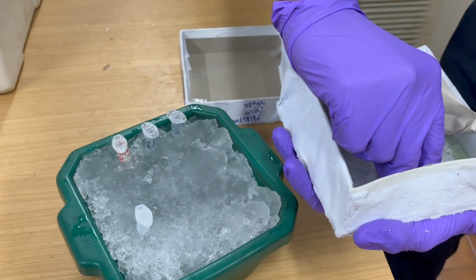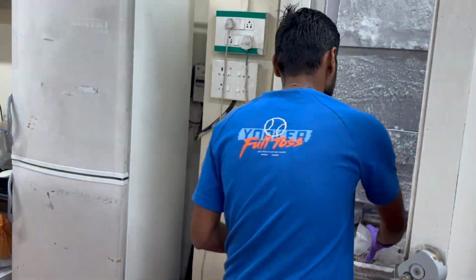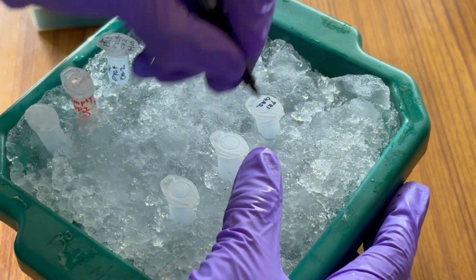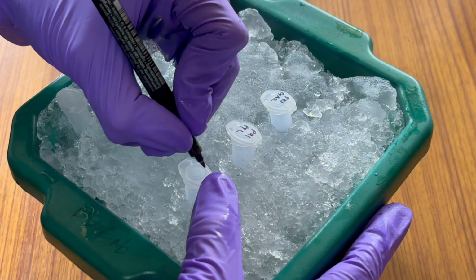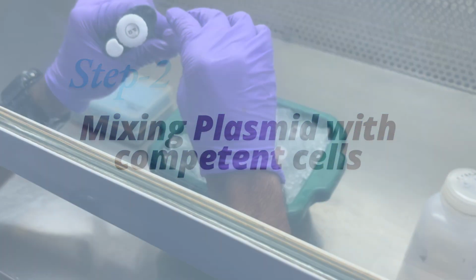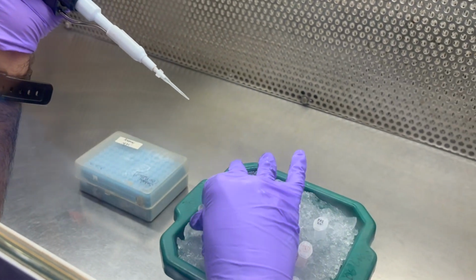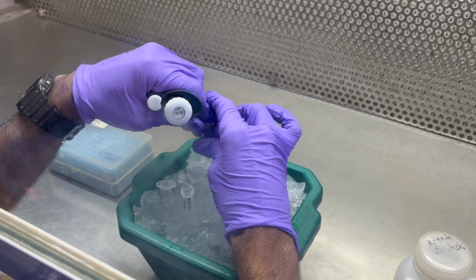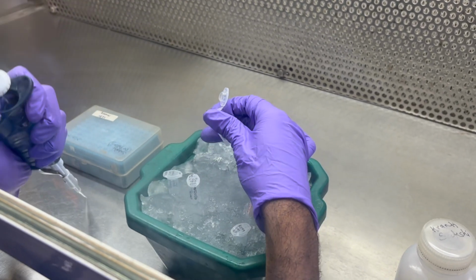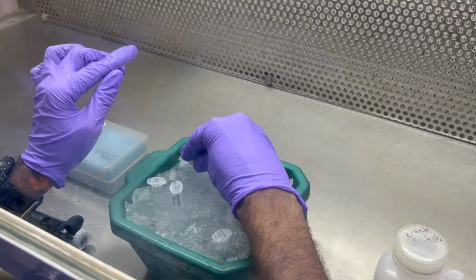So I have competent cells already prepared, and I'm just thawing them on ice for 2 to 5 minutes. Now label the competent cell vials in order to identify in which cells we have transformed what. After labeling the cells inside the laminar airflow, I am adding the plasmid DNA. Here I am adding 1 to 2 microgram of plasmid into the competent cells. Make sure you are adding it inside the cells and not on the walls of the tube.